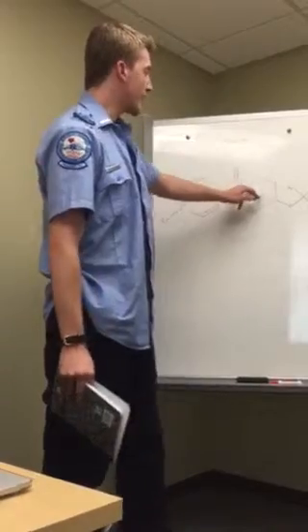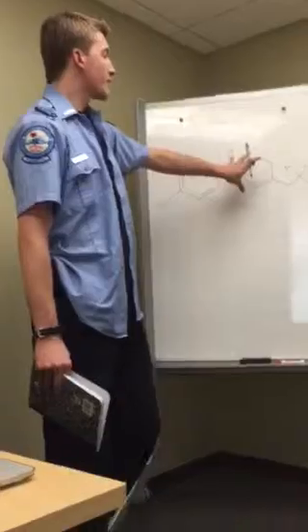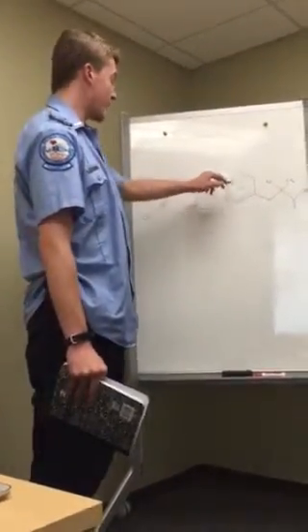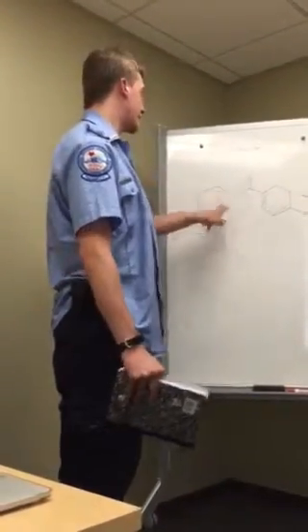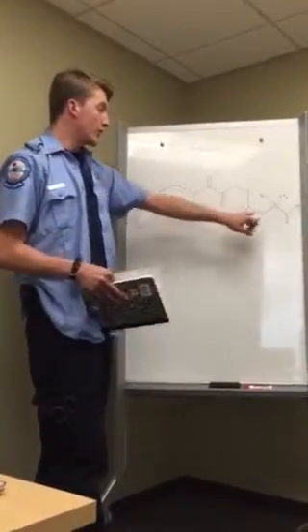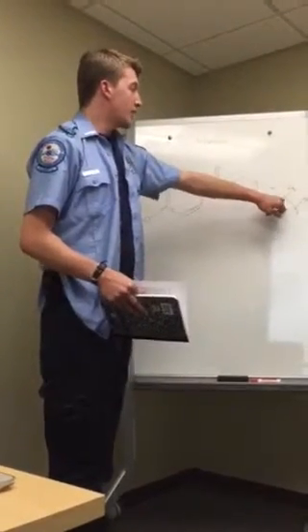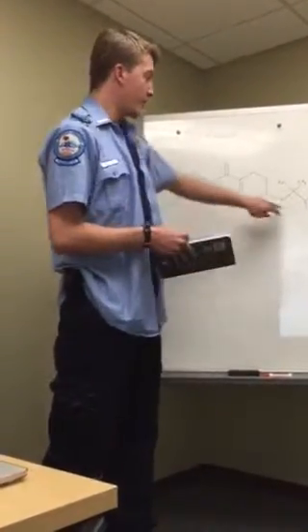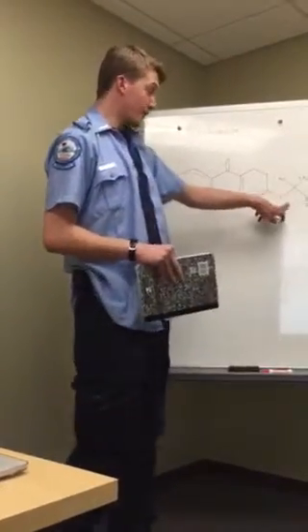Once again, this aromatic ring is exactly identical to this one, so it'll have the same sort of frequencies going on within the ring with the carbon-to-carbon double bonds and the carbon-to-hydrogen bonds. The only difference is that it's connected to an ether and a ketone rather than a ketone and an alkyl halide. So the ether, the oxygen, connected by two single bonds to two R groups, in this case both carbons. Those stretches on the ether C-O have frequencies of 1000 to 1300.